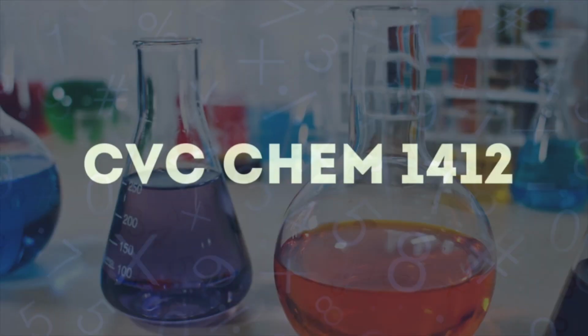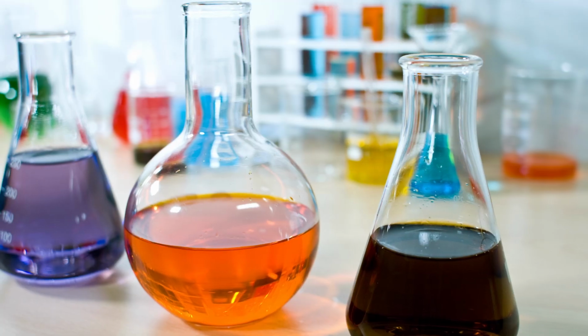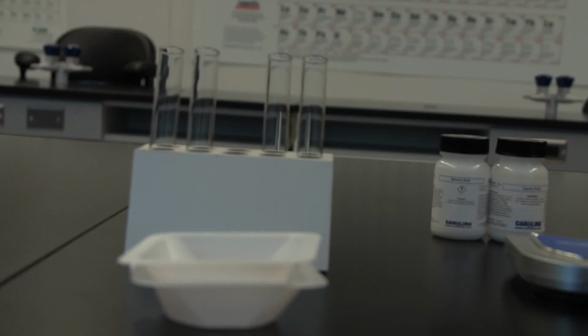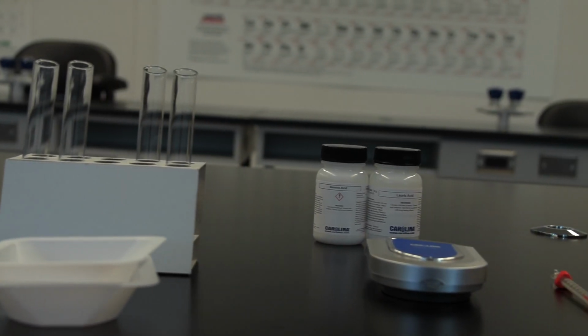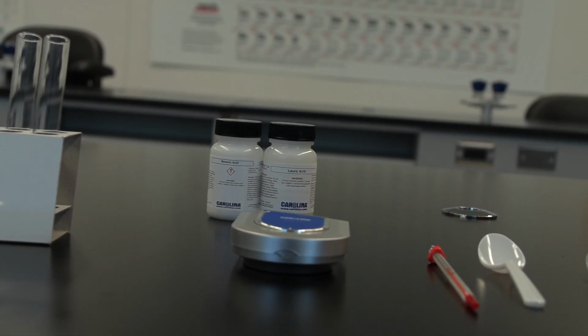In this lab, you will determine the molar mass of an organic solute by using freezing point depression data for a solvent. Given the actual value for the compound's molar mass, the percent error will be determined. Read the procedure, obtain all materials, and select a clean work area.